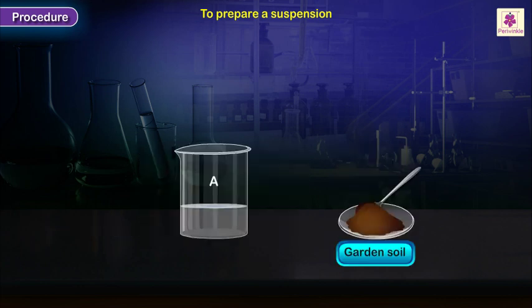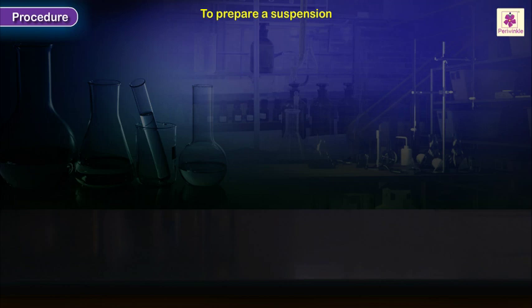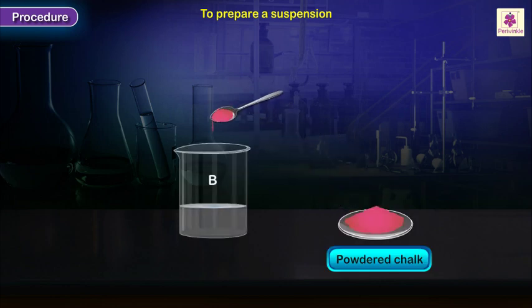Add a spoonful of garden soil in beaker A. Add powdered chalk in beaker B.